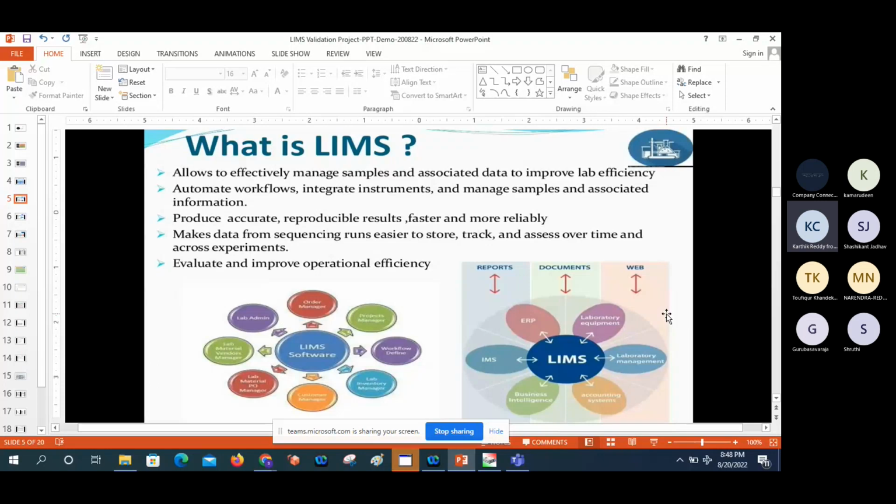There are reports like the certificate of analysis, test summary report, test data sheet, record of analysis, inventory summary report, stability summary report, and instrument summary report. These kinds of reports can be easily obtained from the LIMS. So we can track all the necessary data in one report. If you have one lot or batch, you can check all the specification parameters and their results easily. We can see whether the results are within the specification parameters, and if something happened, whether an investigation was generated or not.